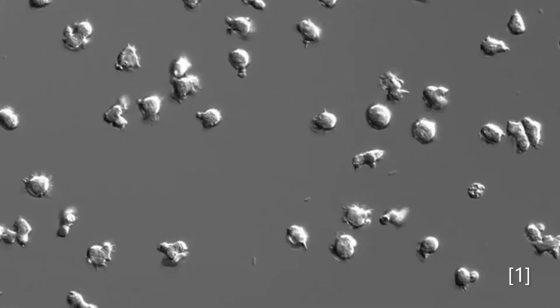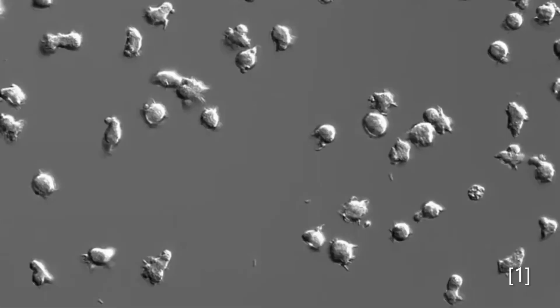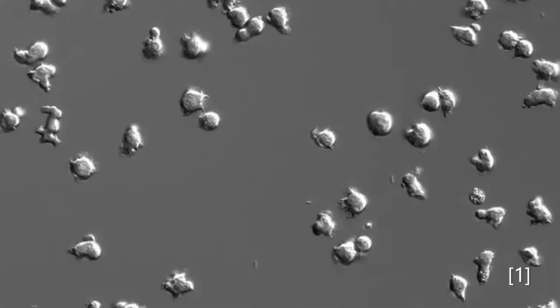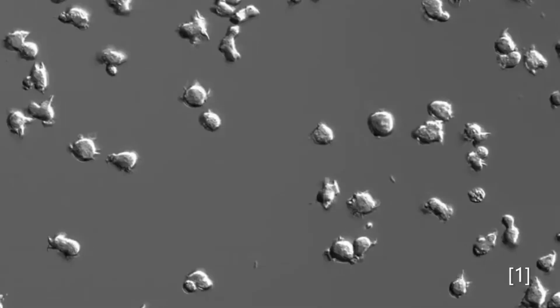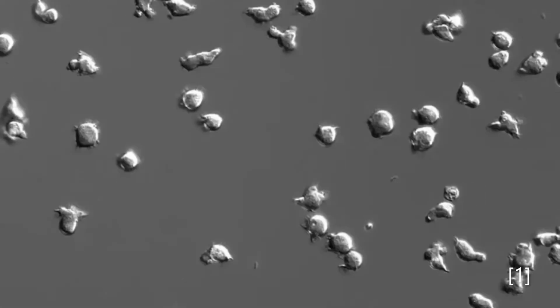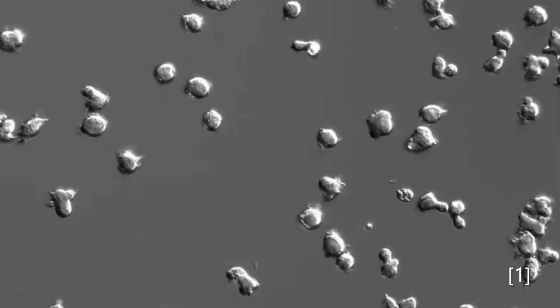If you've seen living cells under a microscope, you've probably seen them swimming around like this. And of course we know cells are moving around the body all the time. White blood cells travel around to combat foreign microorganisms. Muscle cells contract to keep our bodies moving.